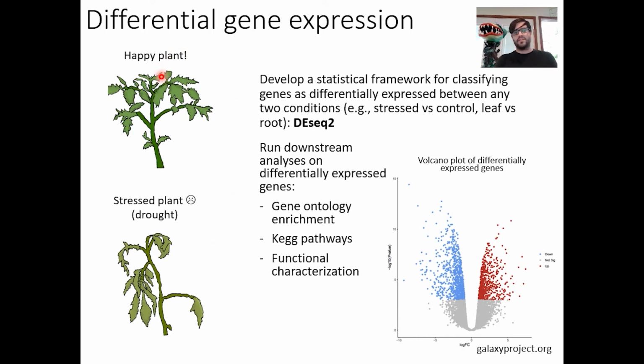So this is really nice, but the downside is that if we only have two comparisons, if you're looking at an extreme phenotype such as drought stress, you might have 5,000 genes that are different between these two plants. And so where do you go from there? You can't do single gene characterization of 5,000 genes. So we can do more elegant and fancier approaches where we're collecting a lot more time points, and we can look at how genes are expressed with each other, and then use that to generate a more robust list of differentially expressed genes.